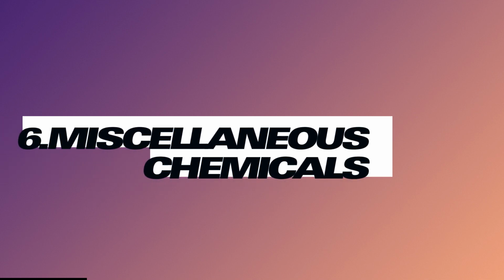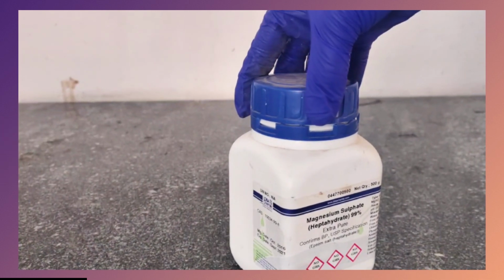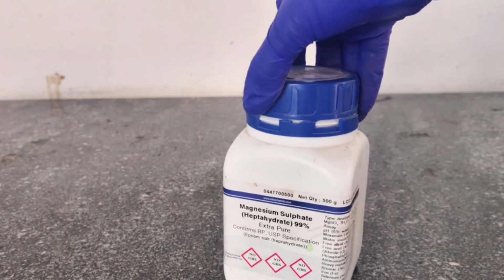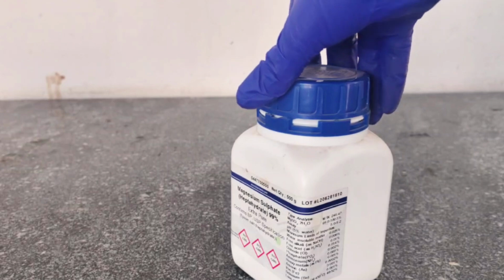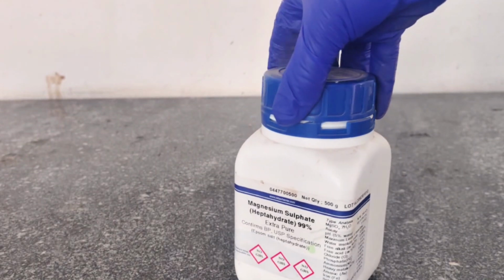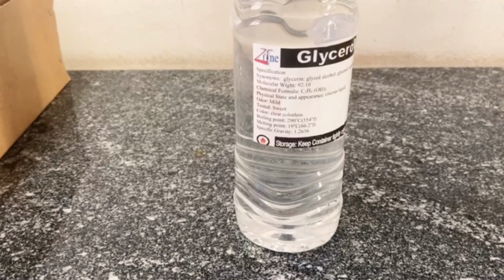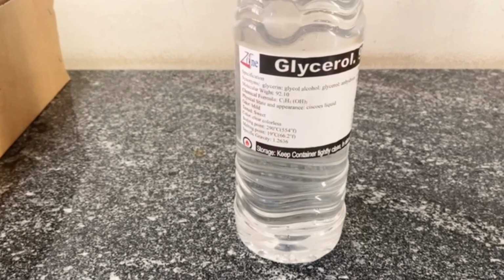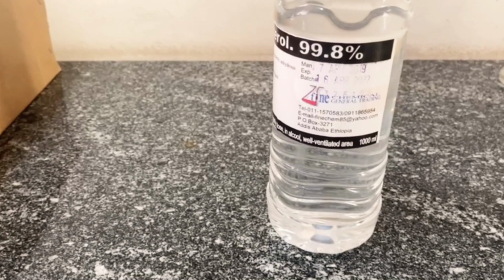6. Miscellaneous chemicals. Magnesium sulfate, a drying agent, can be replaced by calcium sulfate or sodium sulfate. The drying capacity should be checked based on the required moisture removal and concentration. Glycerol can be replaced with propylene glycol for use as a solvent or preservative, but ensure the concentrations match to maintain similar properties in biological material preservation.